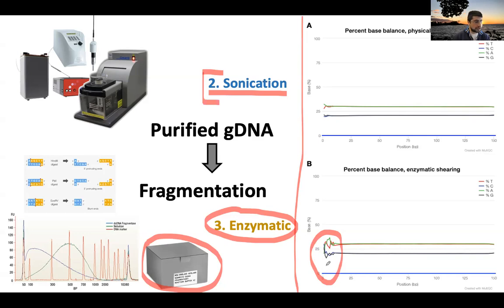mixtures, you still have, in the first few bases, we're talking about the first 5 or 10 bases, some bias for each position. So it's not extremely unbiased, but it's very close to being unbiased.